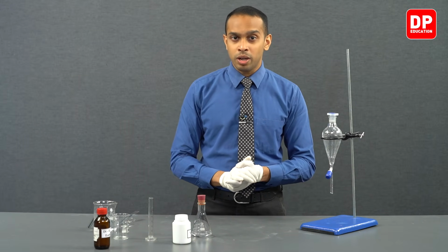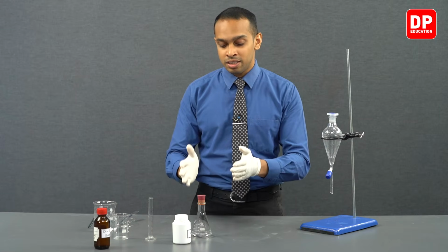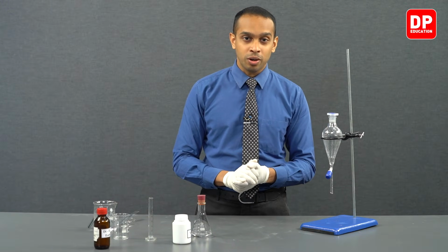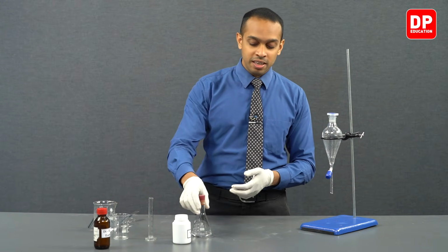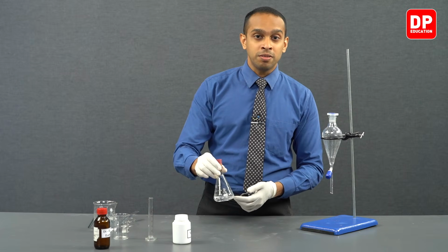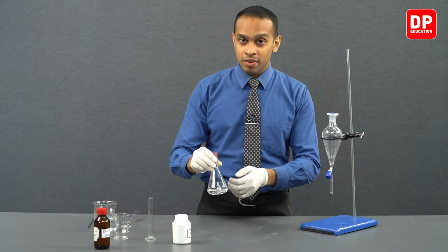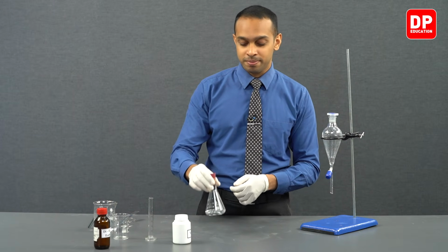At that point, you can be sure that the diethyl ether layer is no longer containing any traces of water. So now let's proceed to add a small amount of sodium sulfate into this and observe whether we have some water present in our diethyl ether layer.